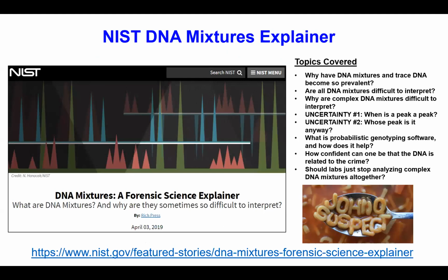Back in April, as part of this effort that we've been working on for almost 2 years now, we came up with a DNA mixture explainer that explains why mixtures are challenging. We have the link here. You just do a search for DNA mixtures. It's one of the top hits you'll get on Google.